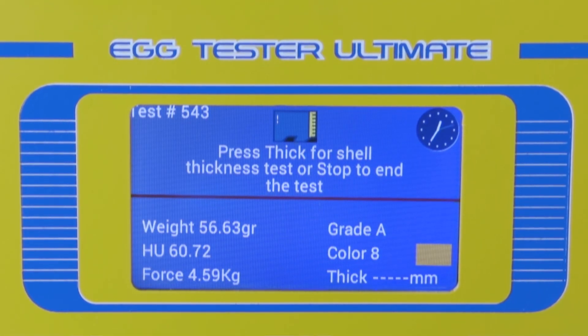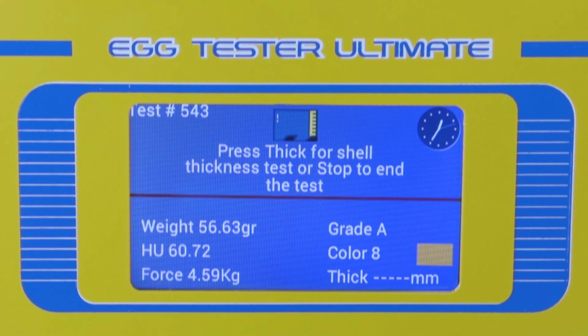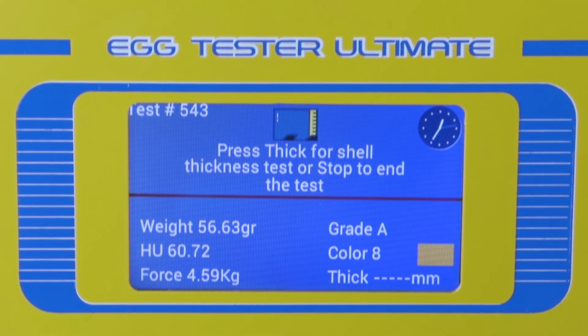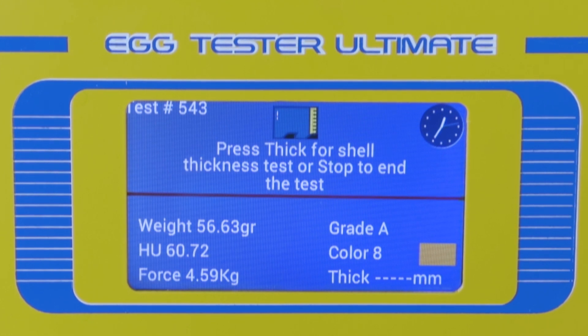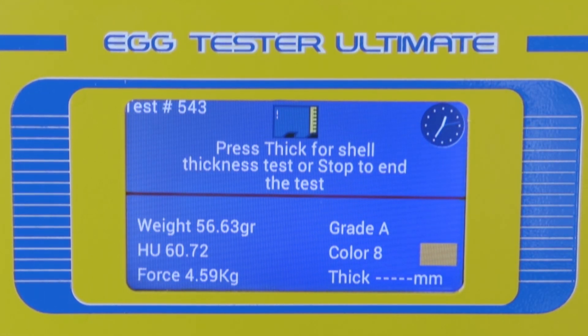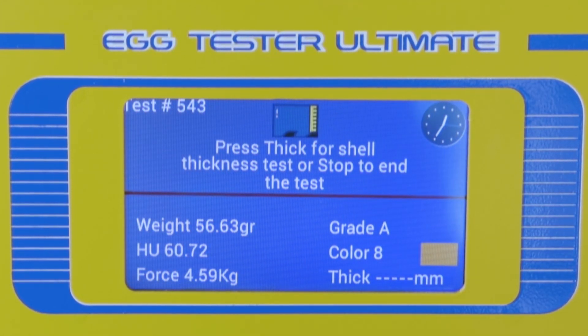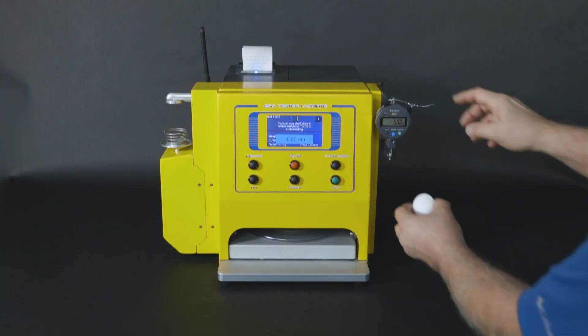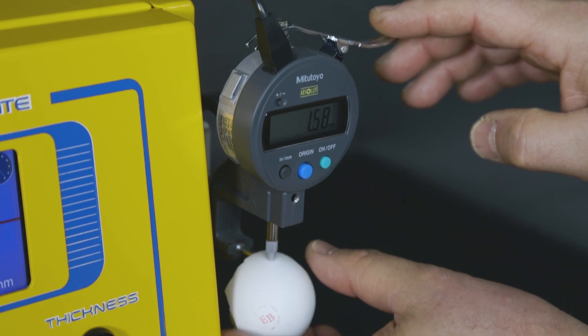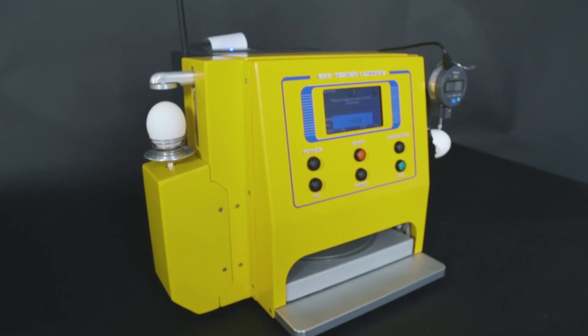The Egg Tester Ultimate calculates the Haugh unit and USDA grade, displaying the results on its easy-to-read 3.5-inch color LCD screen. It creates a real-time chart of the albumin shape and presents the yolk color in RGB numbers or 16 colors of the Roche yolk color fan.